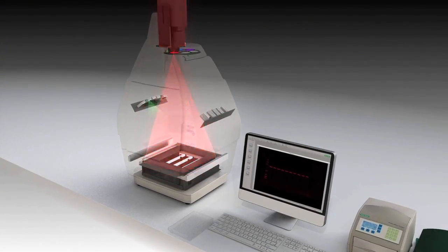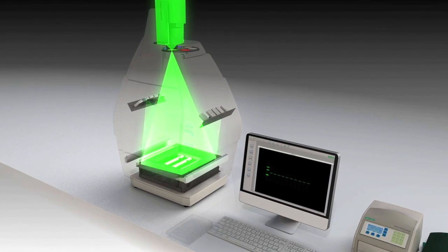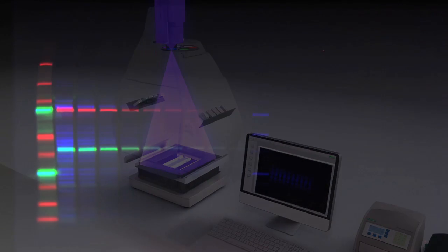Now this new Chemidoc-MP enables this kind of colour vision. The possibility to image these different colours is a great step in evolution.